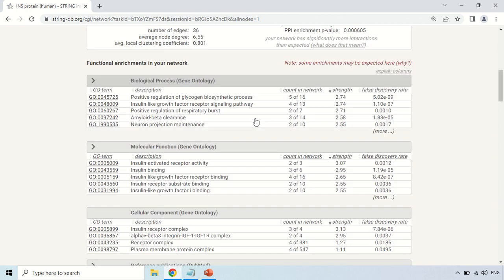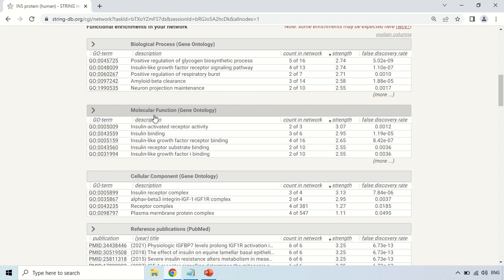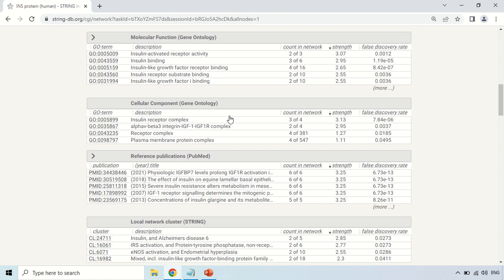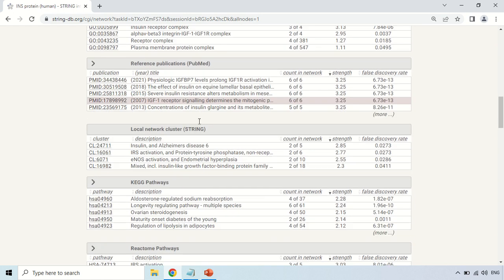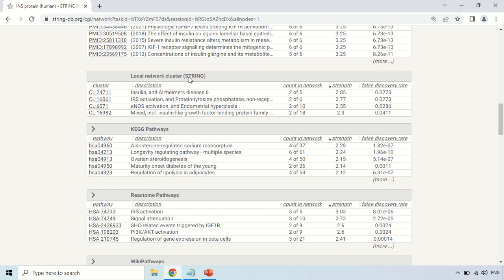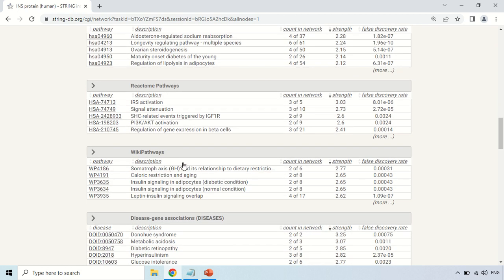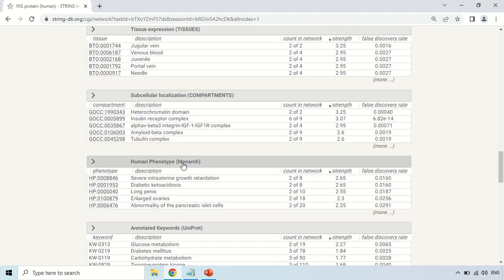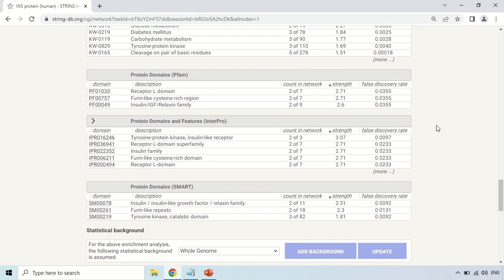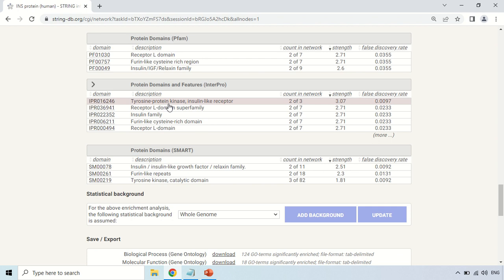Similarly, if you scroll down, these are the different functions based on different databases — for example, on the basis of PubMed reference publications, based on the local network of the STRING tool, functions based on the KEGG database, Reactome, WikiPathways, and so on. These are all the functions deducted from these different databases. You can read them, and just click on any name to have it highlighted with a specific color in that diagram.